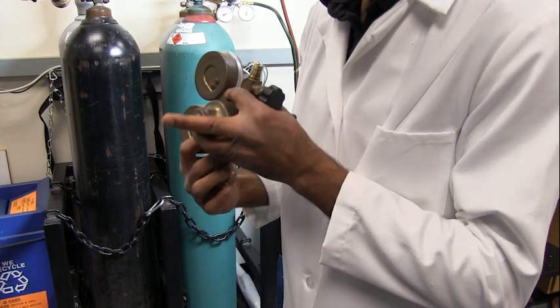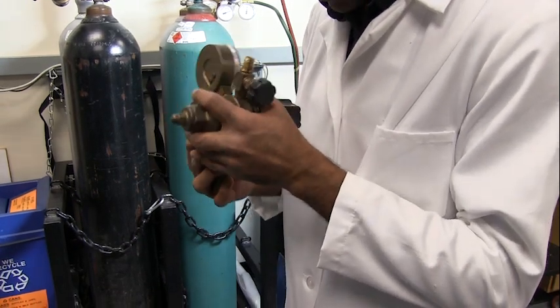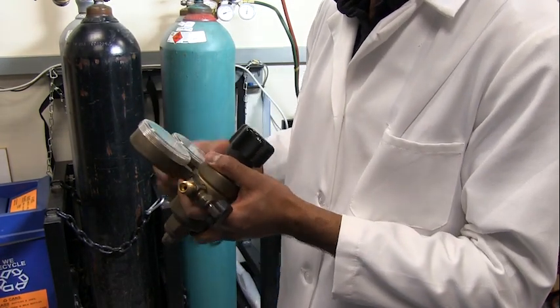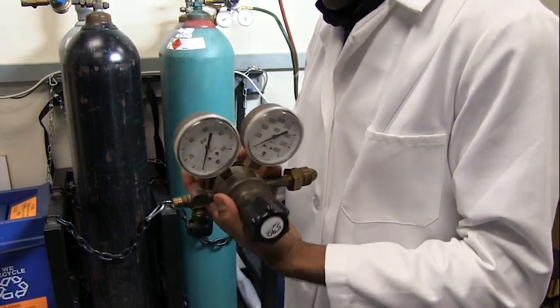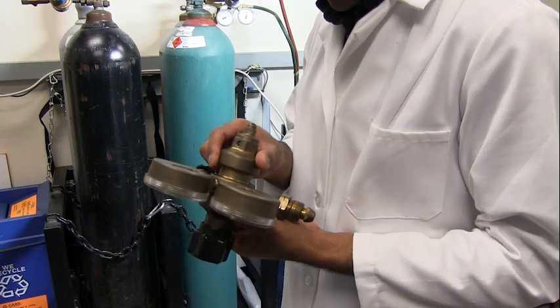Inspect the regulator and gauges for damage and debris. Look for defects that may allow a leak at the connections. Do not connect parts that appear to be damaged. Remove any debris with a clean, dry cloth.